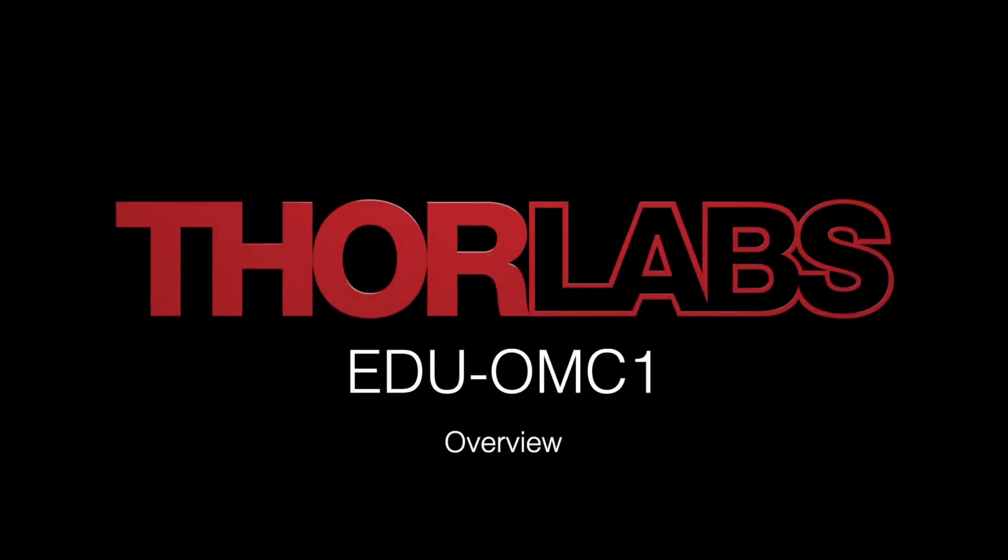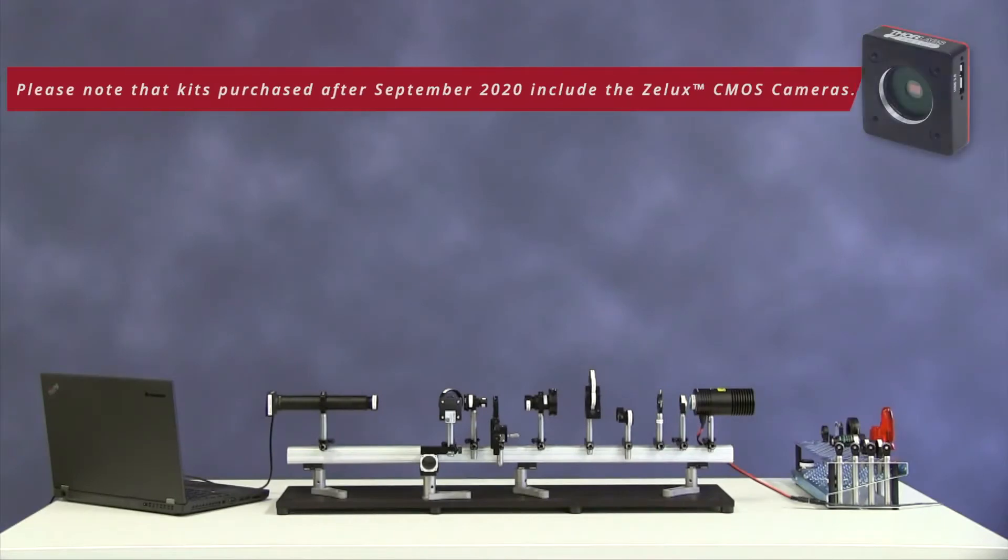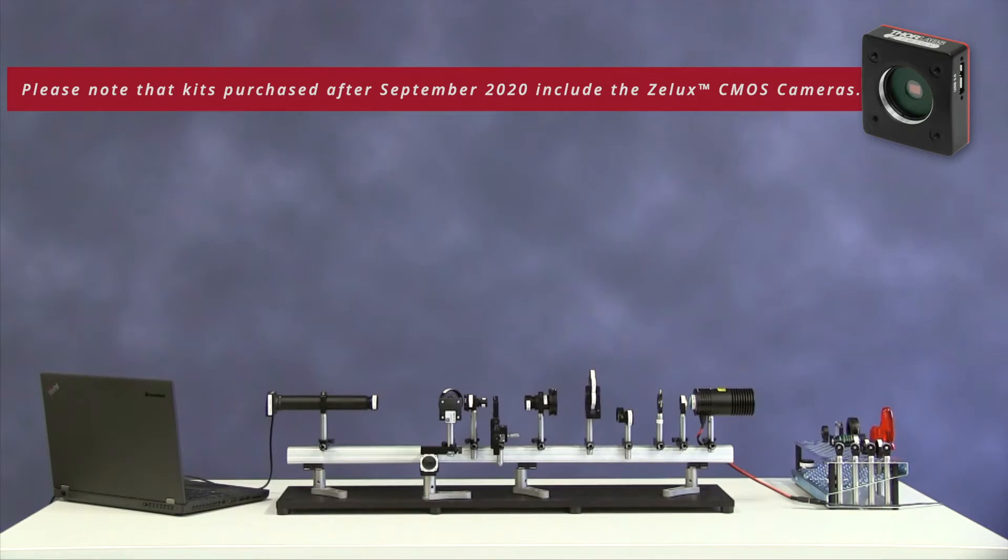The Thor Labs Optical Microscopy Course Kit includes all material necessary for a whole quarter or semester-long optics and microscopy course.